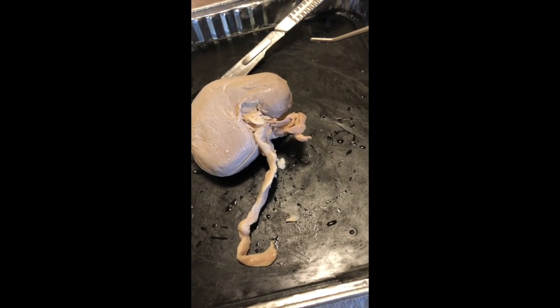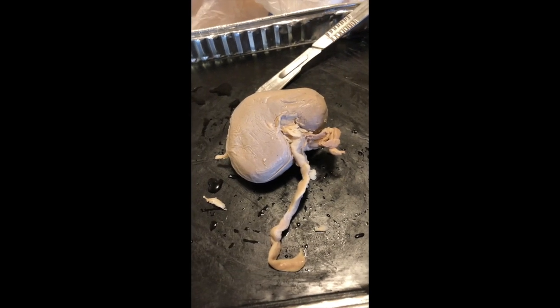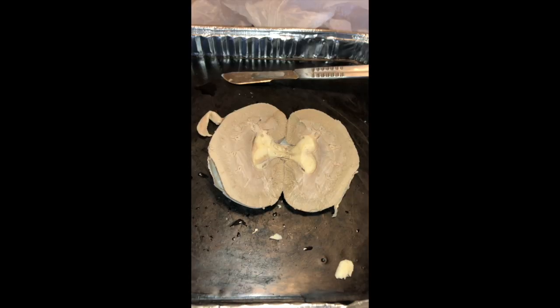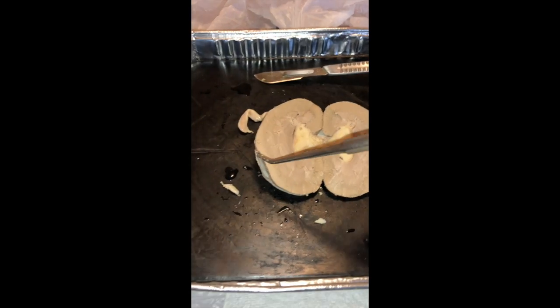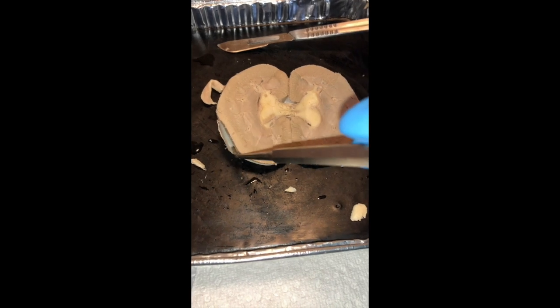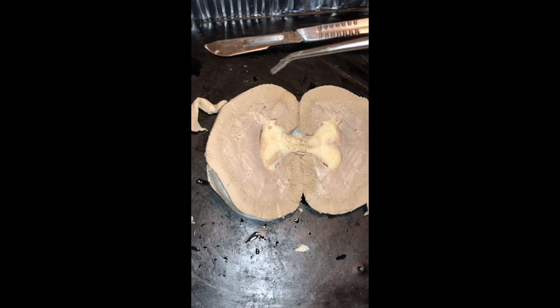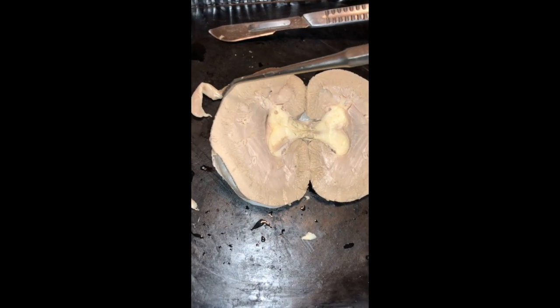The artery is going to bring in oxygenated blood, and the renal vein is going to carry deoxygenated blood out. Okay, so here is my kidney. This outer layer that covers the kidney is the capsule. And then we move into the outermost layer, which is the cortex.